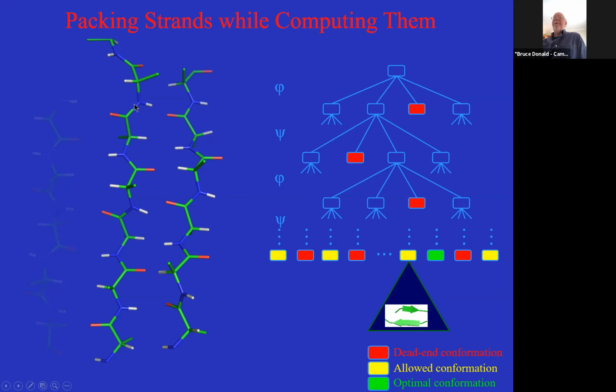So in other words, if you have 4 to 8 different solutions for each phi or psi bond angle, you can imagine this strand potentially going off in some crazy direction like this. But if it has to pack against an adjacent strand, that can be used to prune these restraints. So as the second strand goes down, part of the scoring function for which solutions to pick is based on how well it's satisfying the interstrand NOEs, which are unambiguous. So that was kind of an interesting approach.